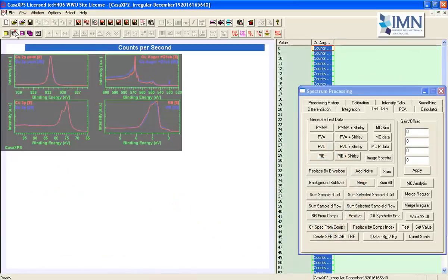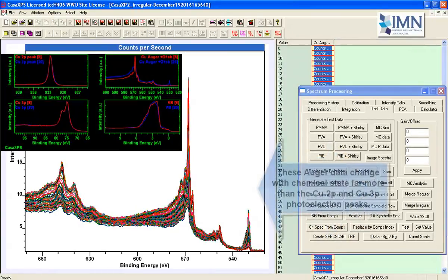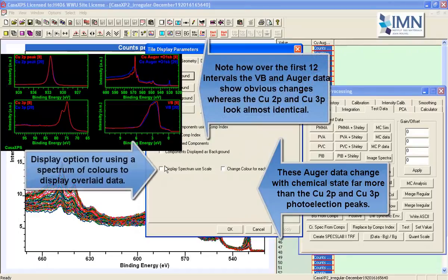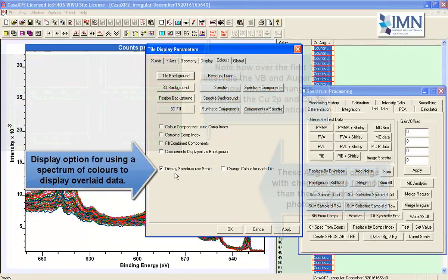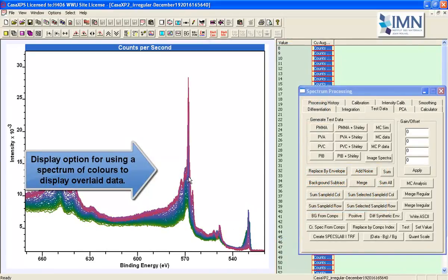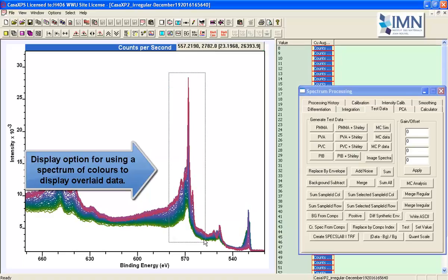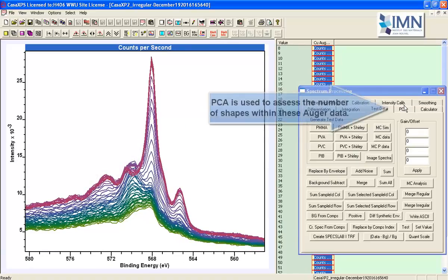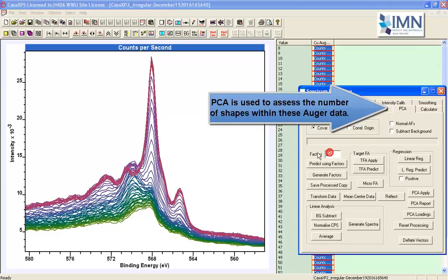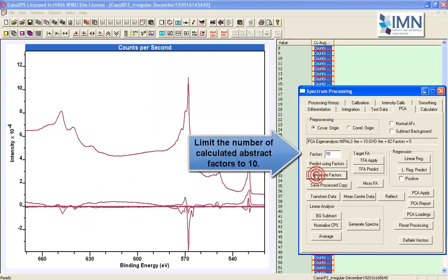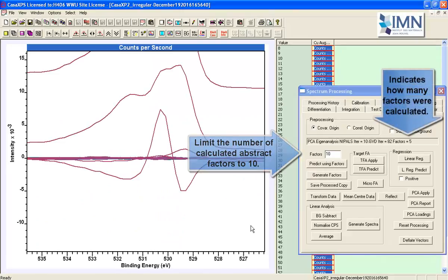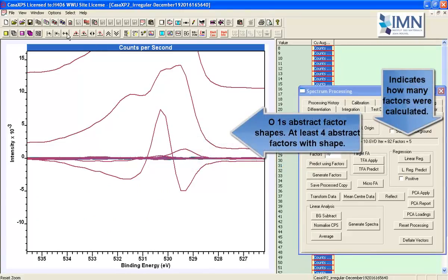We've combined a pair of Auger measurements at different step sizes, so that we didn't have to spend so much time acquiring the broader features of these Auger lines. We could focus on the more characteristic shapes for the Auger line for metallic copper, where we have structure that we would like to capture. Hence, we've targeted our acquisition.